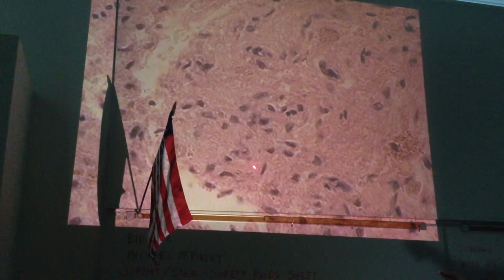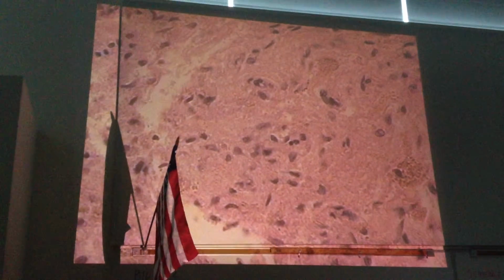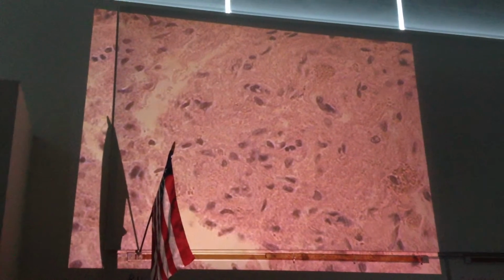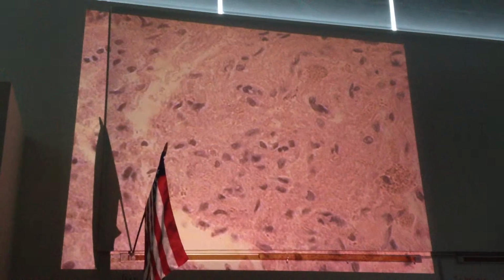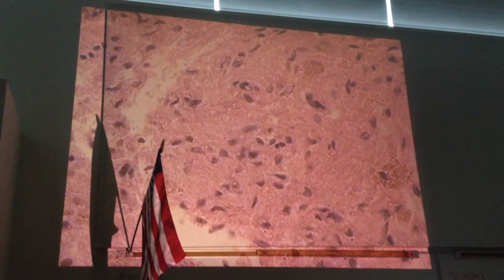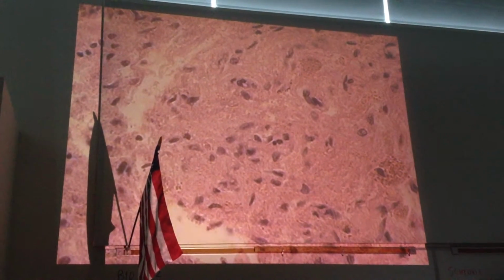Now let's go across the divide over to this side. And all we have is a lot of elongated nuclei that are present here. Those are from connective tissue cells. We don't have those simple cuboidal epithelial cells that are producing hormones. Posterior pituitary doesn't make any hormones. It releases hormones that are made in the hypothalamus and come down through the axons and then are released from the neurons. So no hormones produced here. Hormones are produced in the anterior. So that's how we distinguish those.